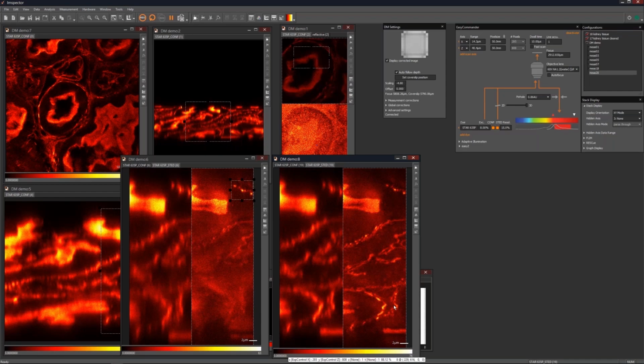When you compare the 3D STED image on the right side to the confocal image on the left side, you can definitely see more structural detail in the 3D STED image. And that's all thanks to the deformable mirror. In this image, the deformable mirror had to be actually very fast because we're doing a vertical scan here, so it's an XZ scan. And basically every line in the image is a different depth level. And the deformable mirror has to adapt its shape in every line to do a different level of compensation of aberrations. So I think we get a pretty good result.